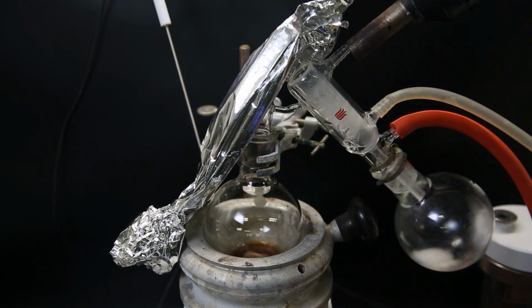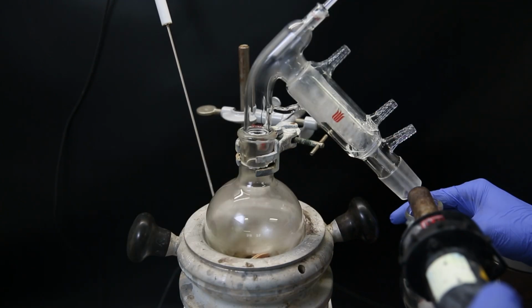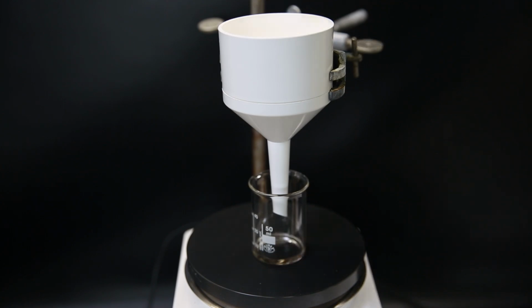After a while, the product starts coming over and solidifies in the condenser as a white solid. I stop the water flow through the condenser so that the solid becomes a liquid again, and then collect it all in the receiving flask. Afterward, I am left with a solid product, but also a liquid impurity. So I remove the impurity through gravity filtration.